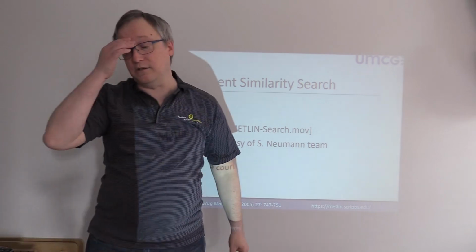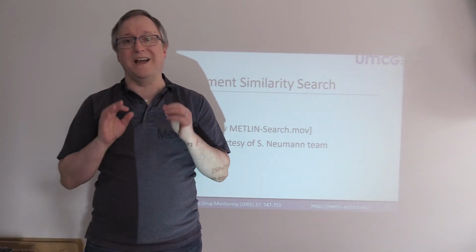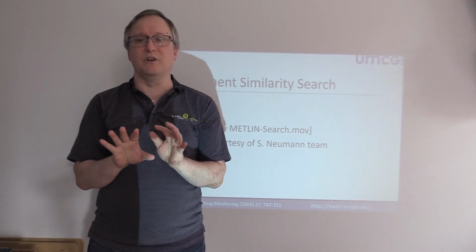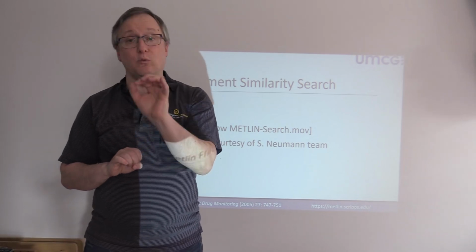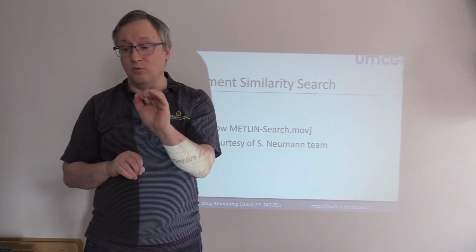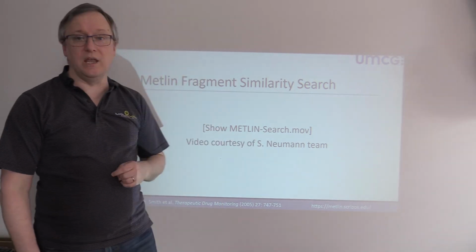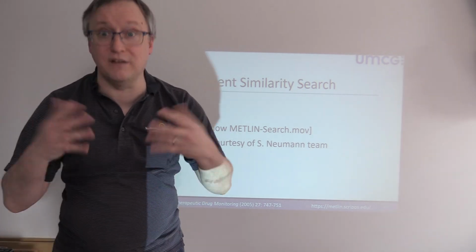Now, I would like to take you through an example of what it looks like trying to identify a metabolite. I'm going to consider for just a moment, we have this one MS, and we want to identify it. So we're going to use an example posted by Stefan's team that goes through this process in video.